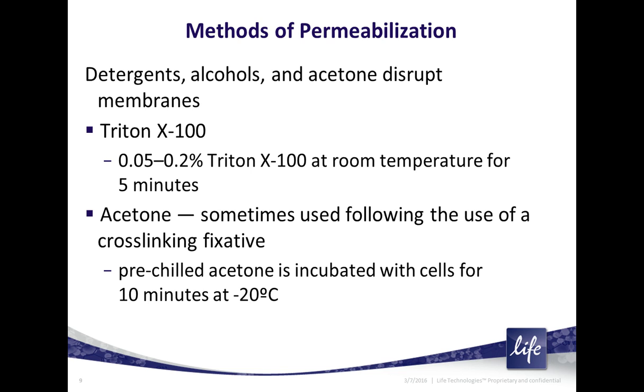Now once you've fixed your cells, you'll give it a couple of washes in PBS or other physiological buffer. At this point, you no longer need to keep it at 37 degrees for most usage. You can do things at room temperature since your cells aren't alive.